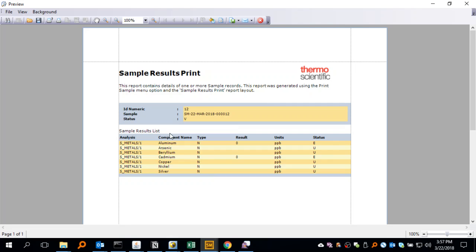This comes up a lot with customers, where they want a space to show up, but they actually don't have the results entered yet, and they want it to show up on a report. And so component lists are one way to do that. The other way to do it is to modify the report to where it's looking at the analysis component table or some sort of combined view where you get the little placeholders for each record. But that goes beyond the scope of this discussion. I think that the easiest, simplest thing to do is to have them implement in their master data the use of component lists.